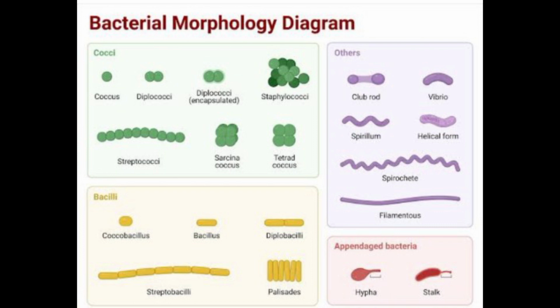Demonstration of capsule: India ink staining, negative staining. The capsule appears as a clear halo around the bacteria. Quellung phenomenon. Special capsule staining.